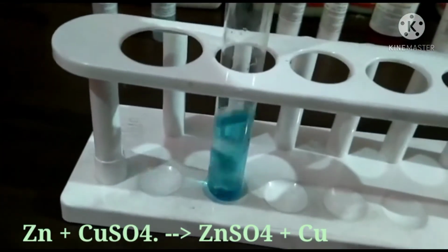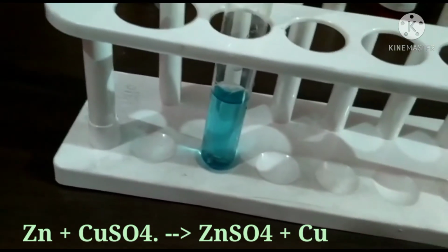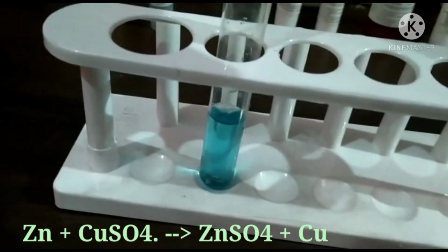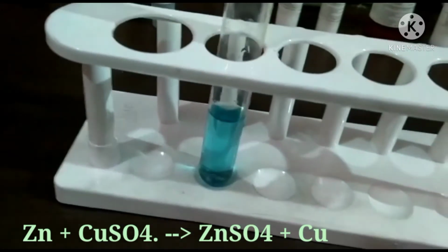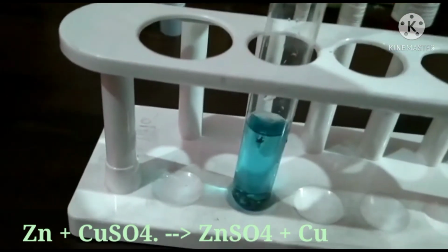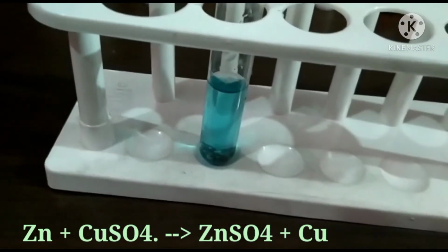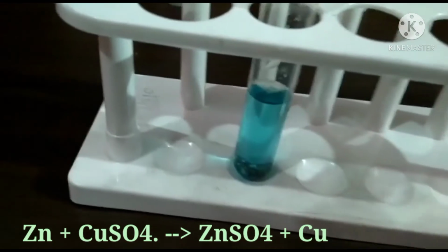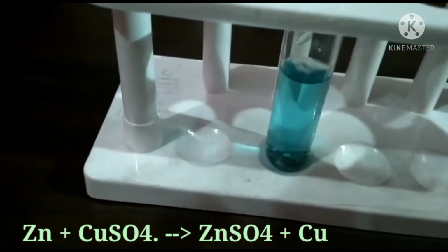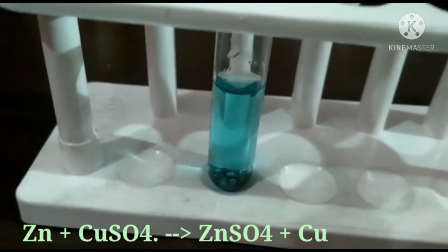Zinc granules again are silver in color. On their addition, we will observe that the solution will become colorless due to the formation of zinc sulfate in the solution, and the zinc granules which we are adding will become brownish. You can easily observe that they are becoming brownish. Why?